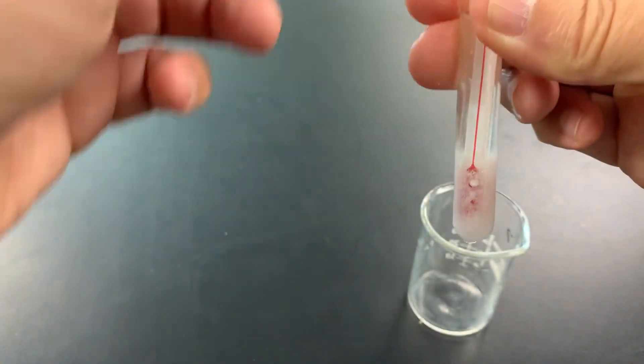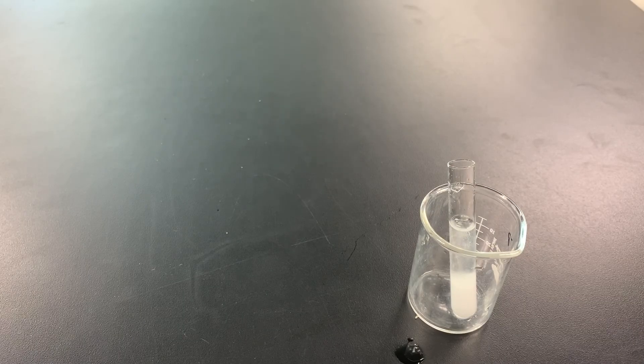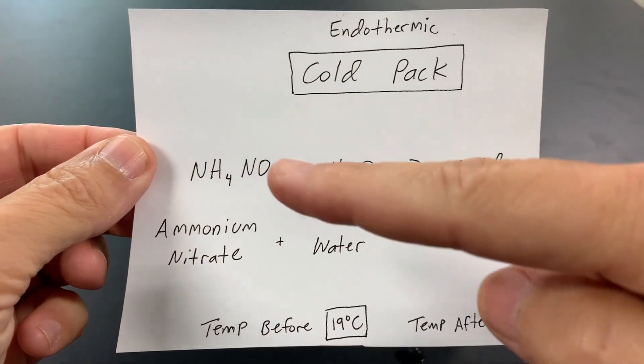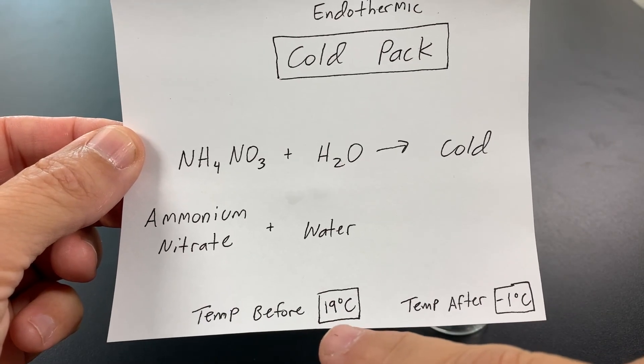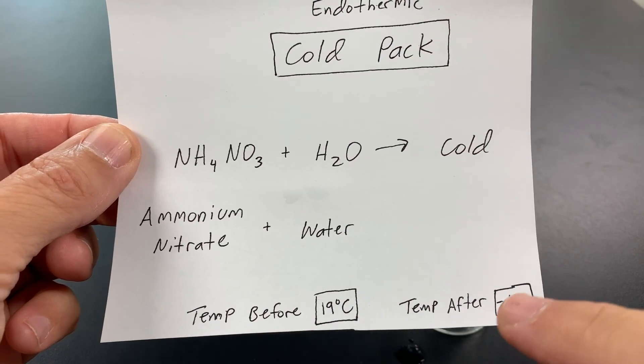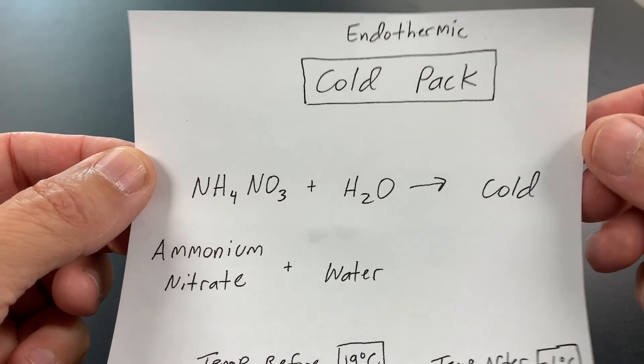Uh-oh, I must have broken the test tube. It's starting to leak. So we got negative 1 degrees. Let me write down the final temperature. Negative 1 degree Celsius. So here's our results for our cold pack. We put ammonium nitrate in water. Started off with a temperature of 19 degrees Celsius. And the temperature dropped 20 degrees down to negative 1 Celsius. Wow, that is really cool.